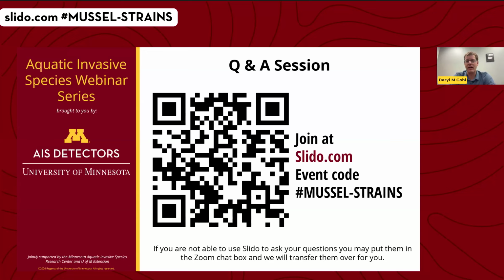approach called microsatellite marking, or sorry, microsatellite. They use microsatellite markers for genotyping, which is a lower resolution approach. And that's actually what Mike McCartney had started doing initially, before the sequencing became a viable option. And we know that, looking at the microsatellite data for, say, Brainerd Lakes region, you couldn't really see any structure with these 9 markers. But when you expand out to the thousands of genomic markers, you can start to see those differences between lakes.